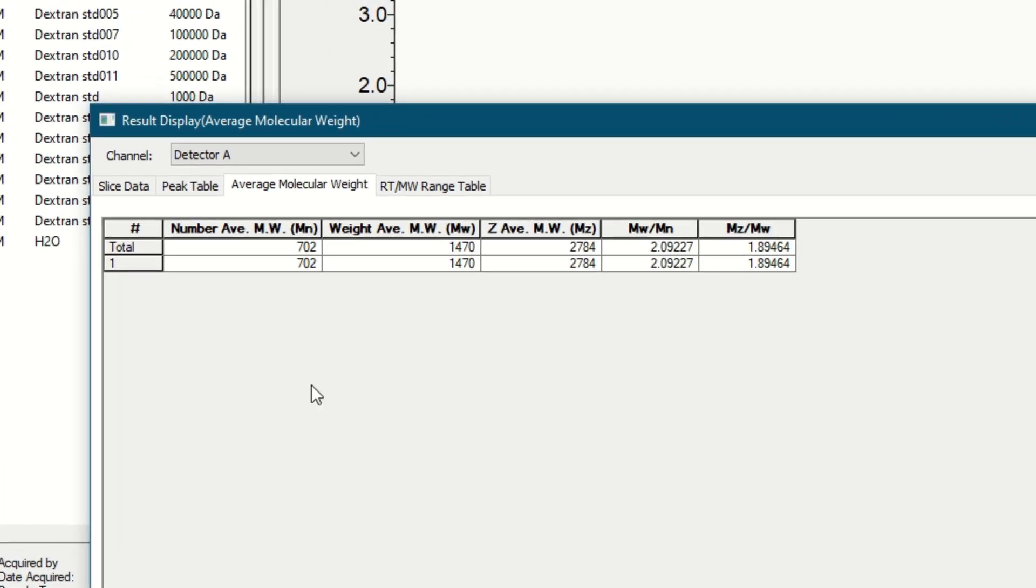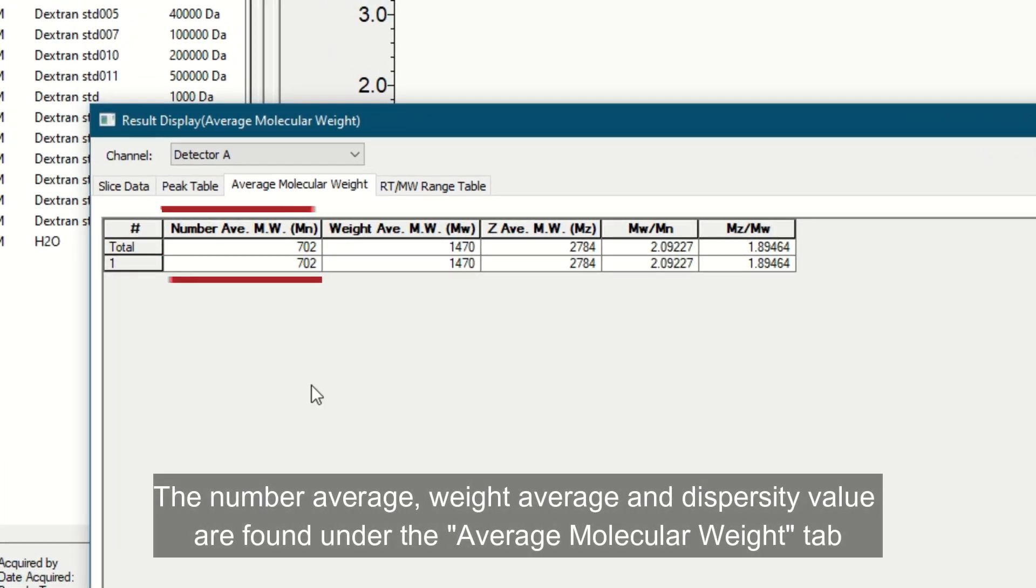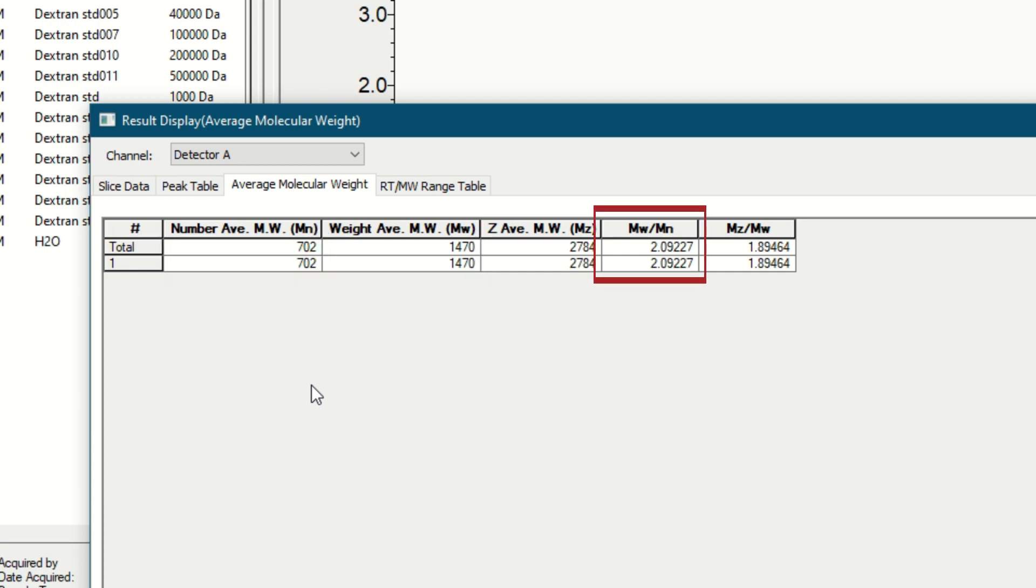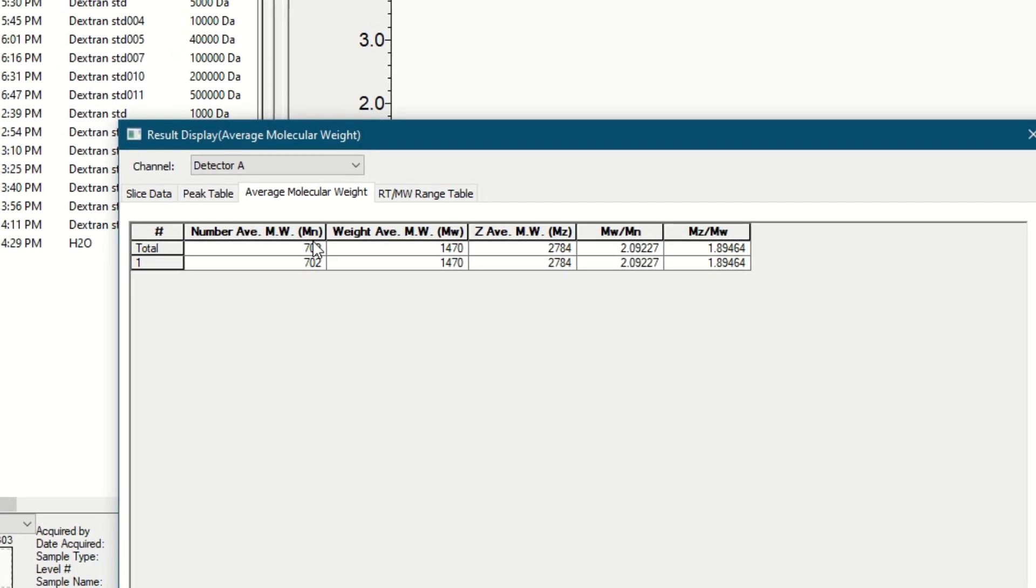Under the average molecular weight tab, the number average, weight average, as well as the dispersity value can be found. The closer the dispersity value is to 1, the narrower the molecular weight distribution. This brings us to the end of the video on how to determine the molecular weight of polymers using the Shimadzu gel permeation chromatography systems.